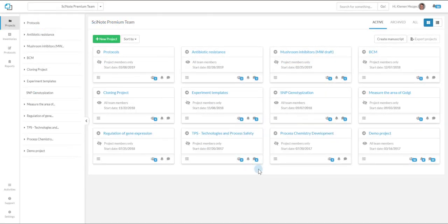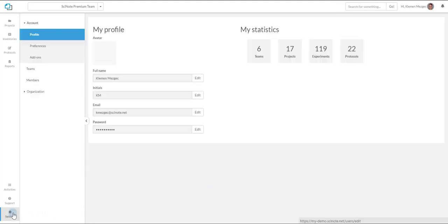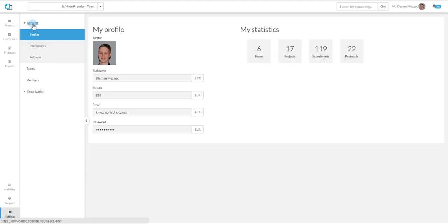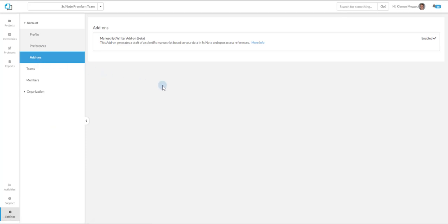When you create your account in SciNote, Manuscript Writer add-on will be automatically activated for you. Add-ons in SciNote are located in the Settings tab, under Account, and Add-on tab. Here's where you can find the Evergreen SciNote add-on store.